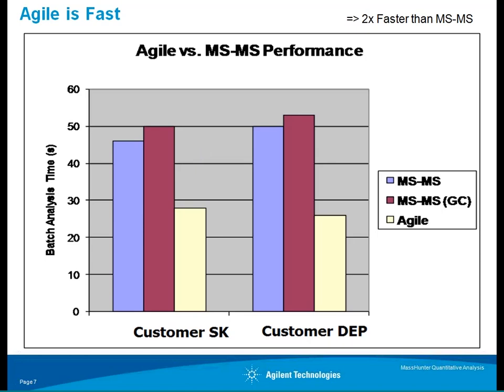And last, but extremely importantly, is the speed or performance. If we take a look at a small study of large batches doing the entire analyze operation, you can see that the Agile integrator speed makes a significant contribution because the total analysis time is reduced by a factor of roughly 2 in this release. That can make a significant difference in your speed of analysis in batch at a glance.